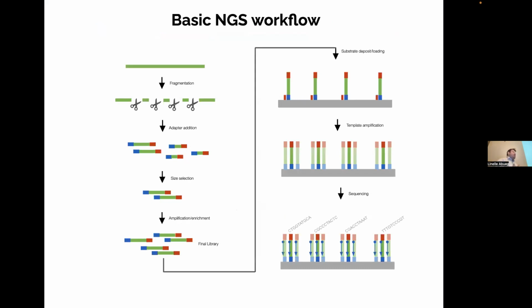All right, so I'm going to go through the basics of next-gen sequencing. As you described, next-gen sequencing is second generation and third generation. They all look about the same. You start with a DNA fragment, and you fragment it into smaller pieces that you can handle.